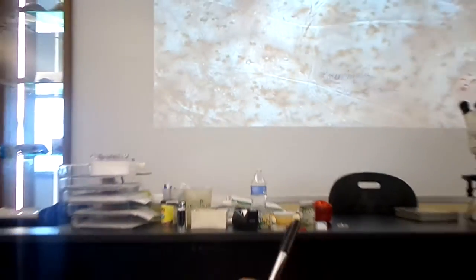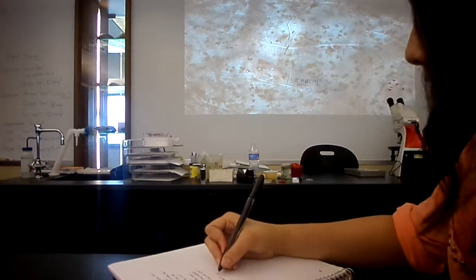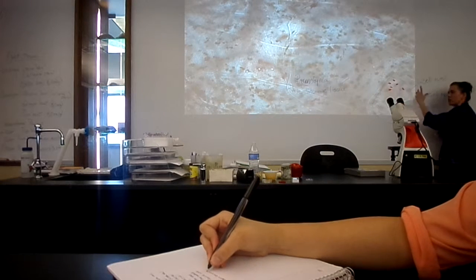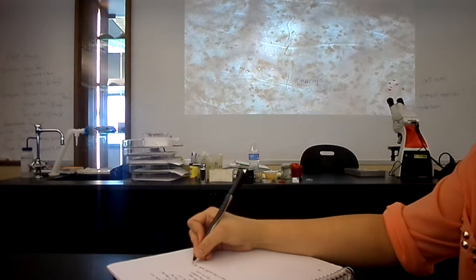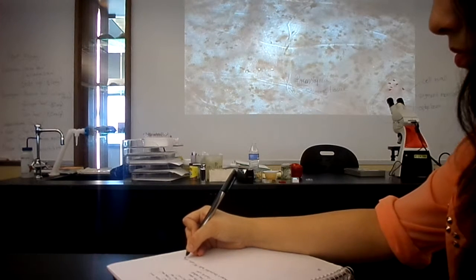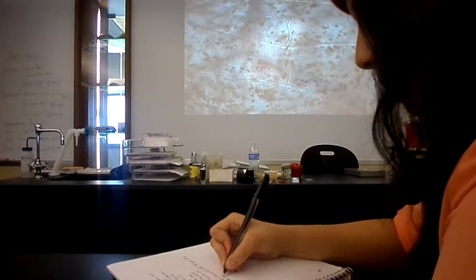So parenchyma is a whole bunch of loosely packed cells that are pretty big, and they store something. In this case, the parenchyma cells are storing pigment molecules. They could store sugars. They could be storing starch. They could be storing any number of things, depending upon where the tissue is located. Okay? The whole thing is a tissue.